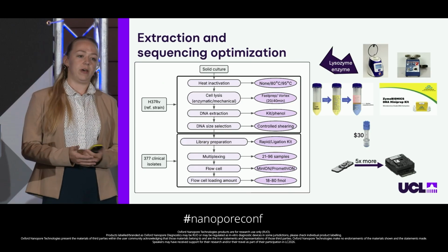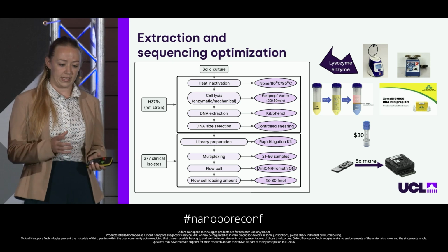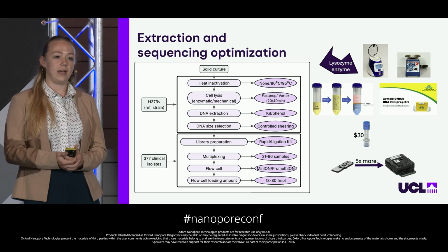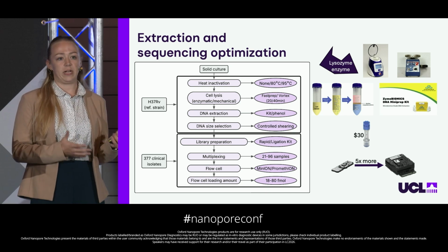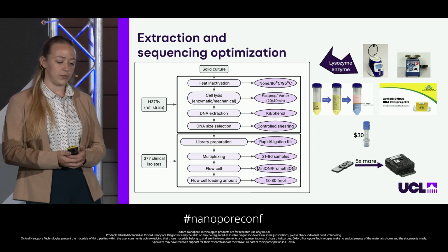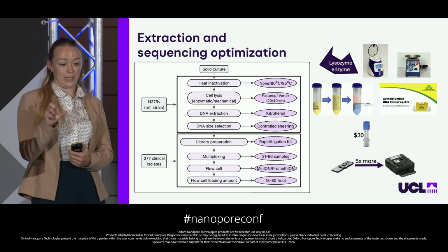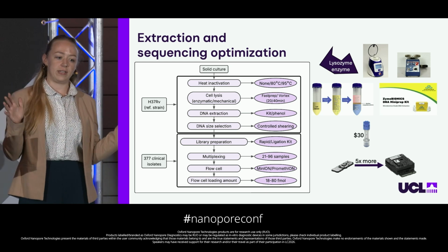We tested different methods of lysis, enzymatic, bead beating, different bead beaters and vortexes and speeds, because overbeating fragmented our samples too. We compared an extraction kit using columns from Zymo with a very well-known phenol-chloroform separation method that lots of labs use. And we also experimented using this Covaris G-tube, which is a really expensive tiny tube, which is good for bringing down the longest fragments.